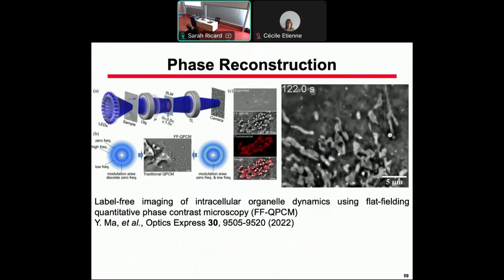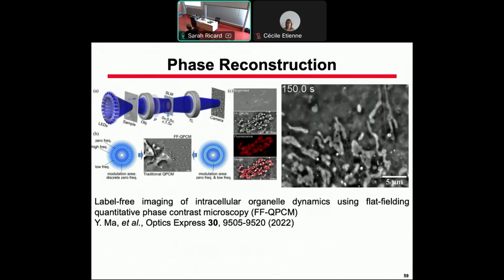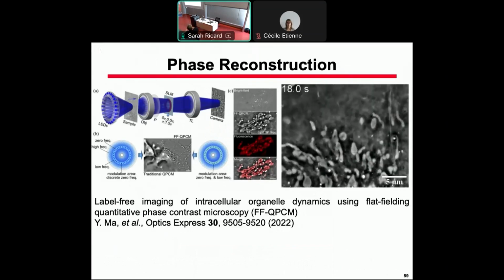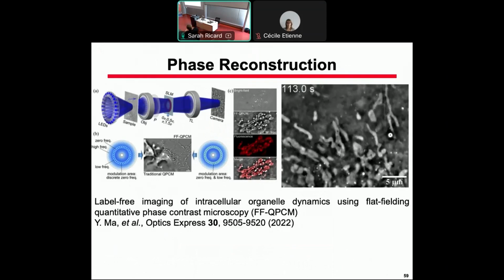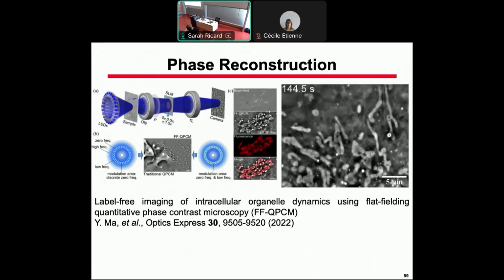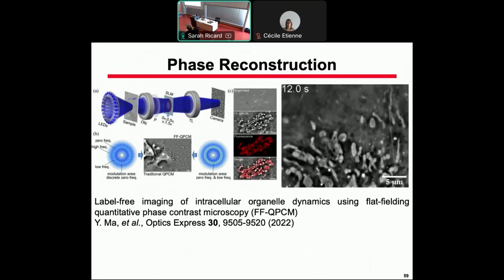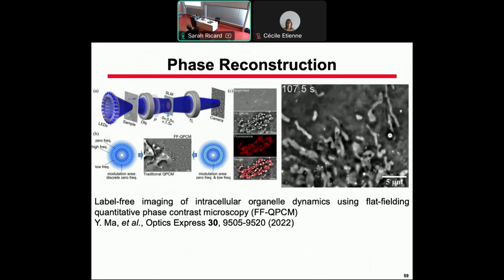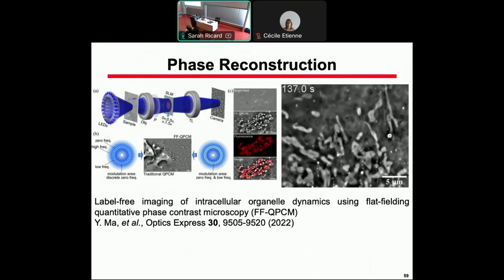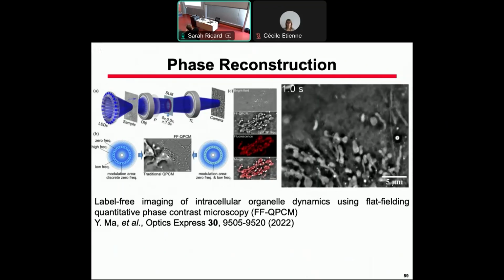Another domain now very active is phase reconstruction. Not phase measurements like in holography, but in many cases, under some assumptions, you can reconstruct the phase from intensity-only measurements. The main interest is that you can go extremely fast, and here you see the movie where they could perform a tomography, not measuring the phase, but very rapidly measuring the intensity images, and then numerically reconstruct the contrast.